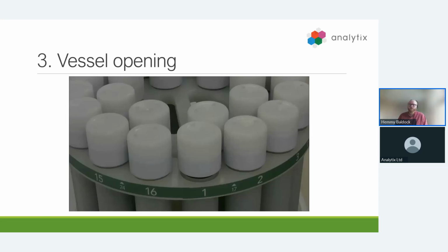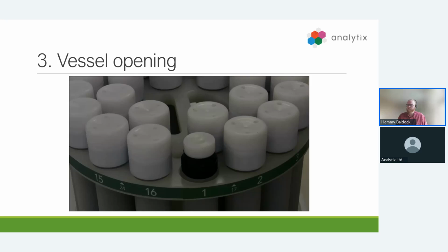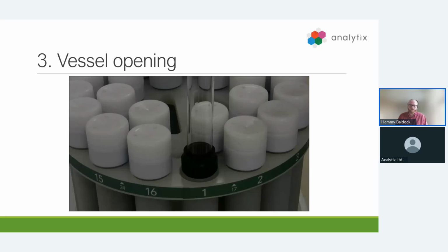The final step of the workflow is to simply open the vessels. This can either be done by hand or by the dedicated tool. Here you can see the dedicated tool opening the vessels and removing the glass vials. Here, the samples can then be taken for pre-analytical workup steps and subsequent analysis.